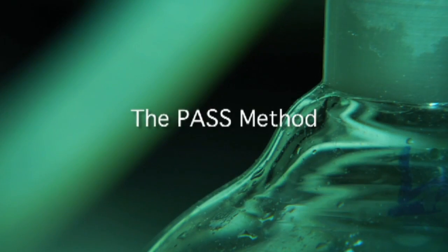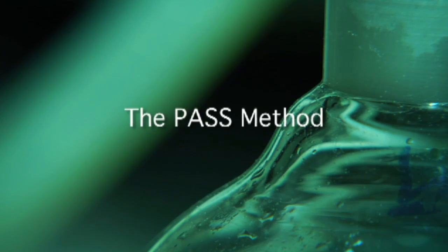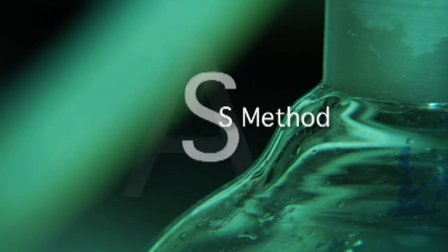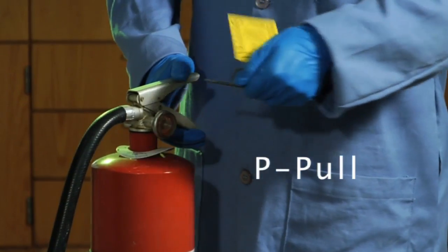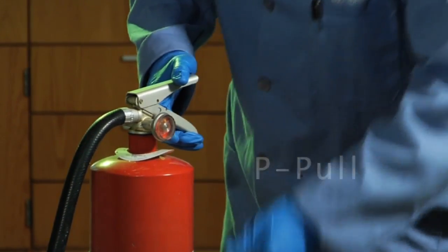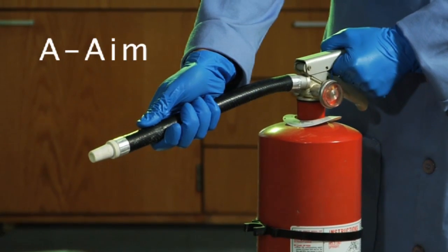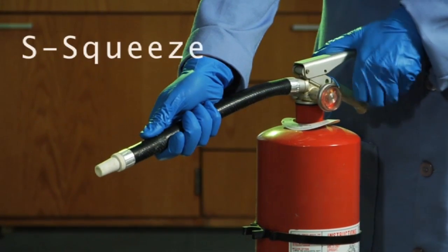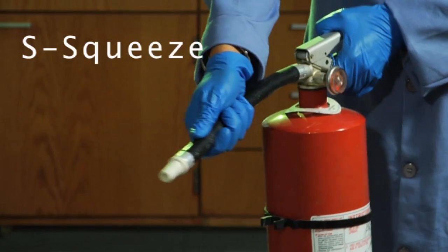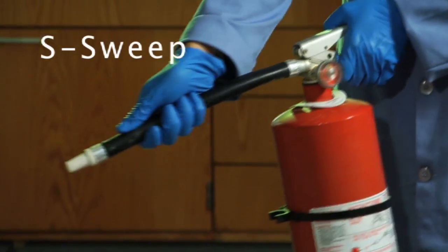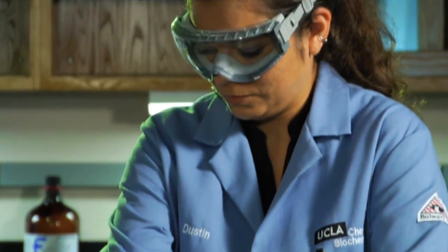Once properly trained on how to use a fire extinguisher, always remember to use the PASS method. P pull and twist the safety pin from the handle. A aim at the base of the fire. S squeeze the handle trigger and S sweep from side to side the full length of the fire.